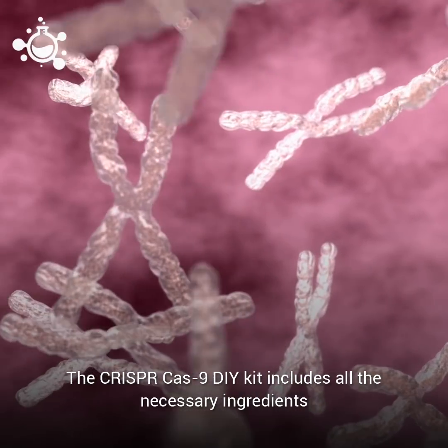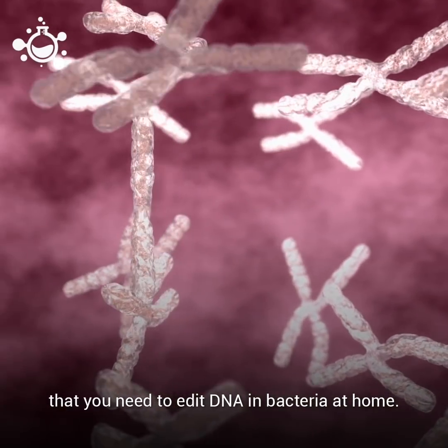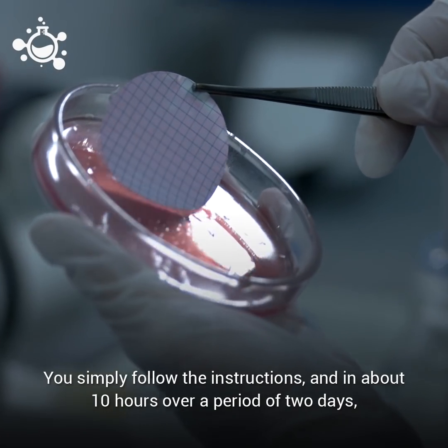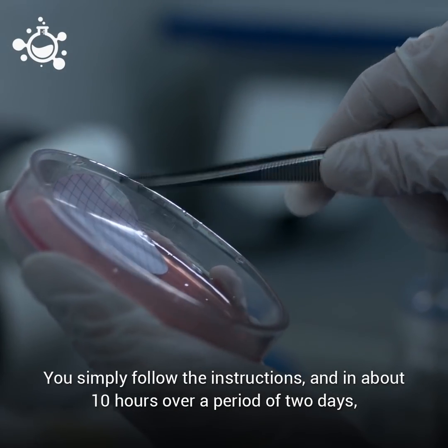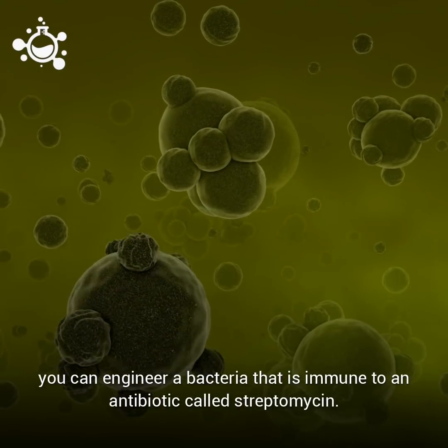The CRISPR-Cas9 DIY kit includes all the necessary ingredients that you need to edit DNA in bacteria at home. You simply follow the instructions and in about 10 hours over a period of two days, you can engineer a bacteria that is immune to an antibiotic called streptomycin.